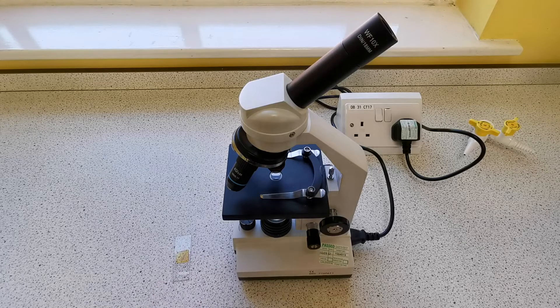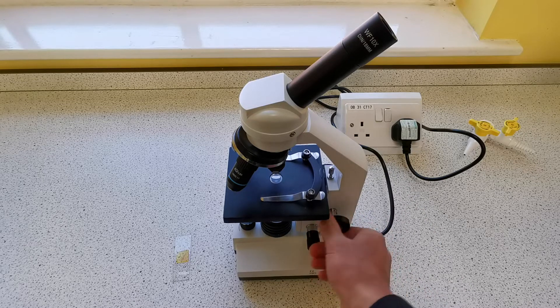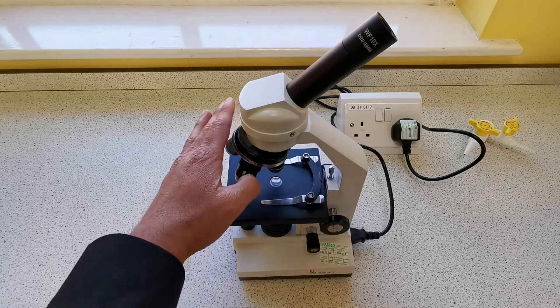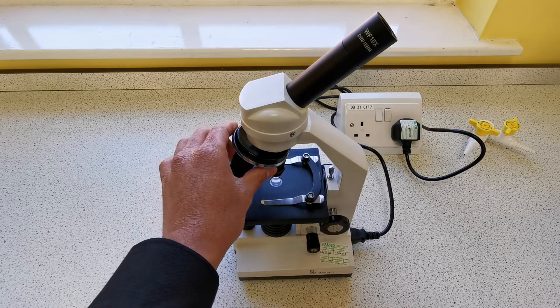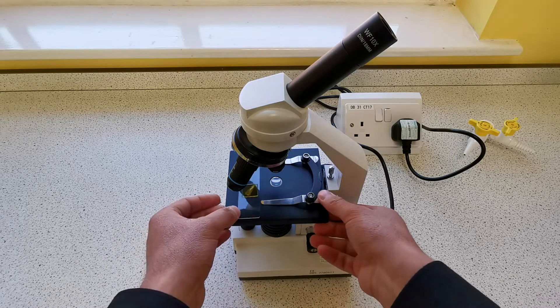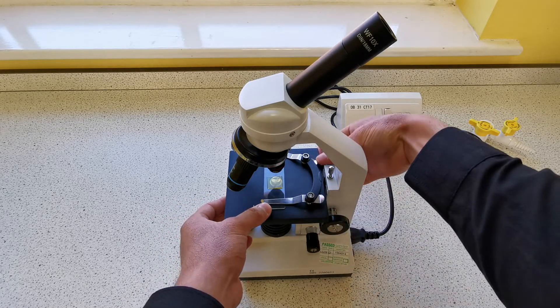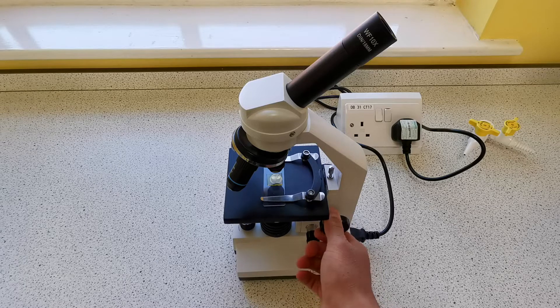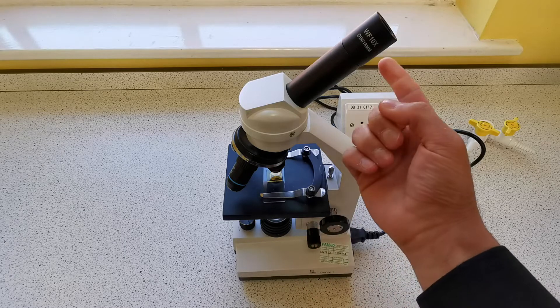Now that we have our slide prepared, we want to observe the sample using the microscope. The first thing you want to do is make sure the stage is in its lowest position, and we want to select the objective lens with the lowest magnification first — in this case it's the red one with a magnification of times 4. Then you want to load the slide onto the stage and clip it into place.